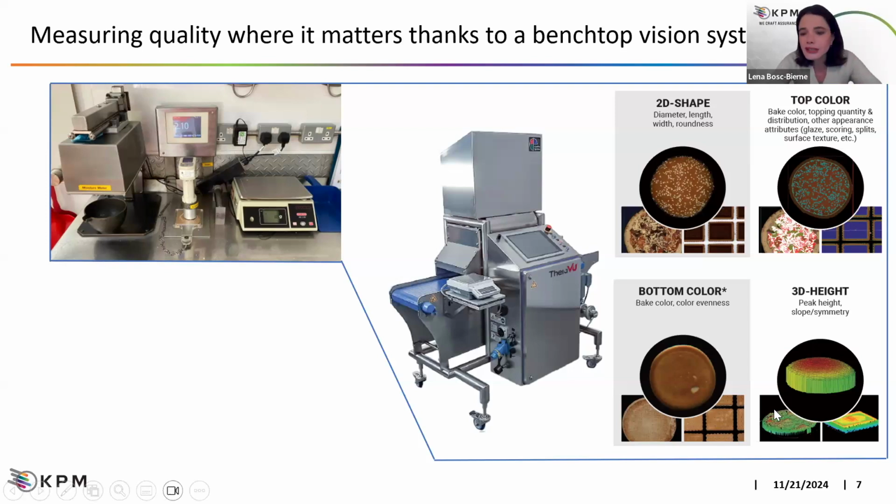And also it is equipped with a laser. So with a 3D laser camera that will allow to assess information such as the height and, of course, then the volume.